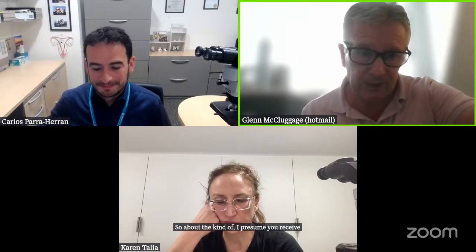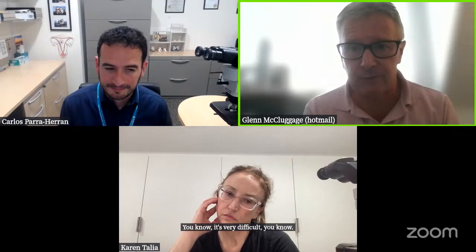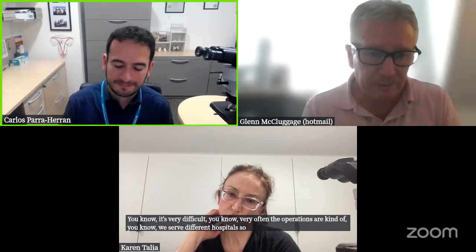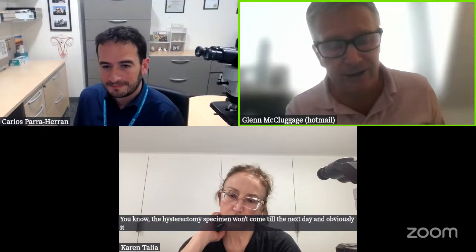About the kind of, I presume you receive all your hysterectomies for endometrial cancer unfixed. So in the UK, we do all biomarkers on the biopsy, which is better fixed. In Belfast, we do the molecular and all the biopsies, and it's very difficult. Very often the operations are, we serve different hospitals, so the hysterectomy specimen won't come till the next day, and obviously it's kind of unfixed, and you don't have problems like that?